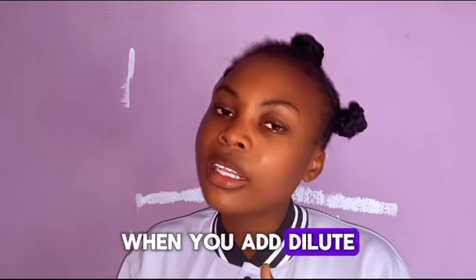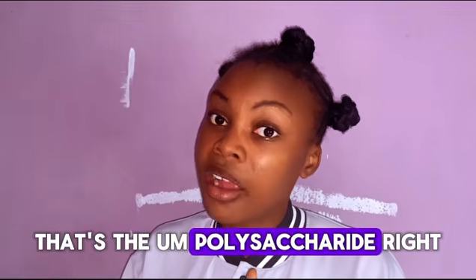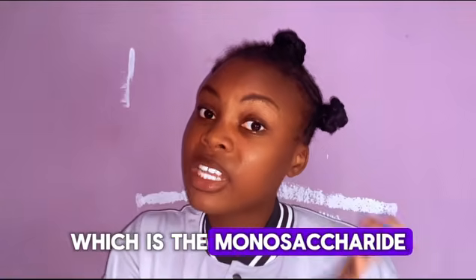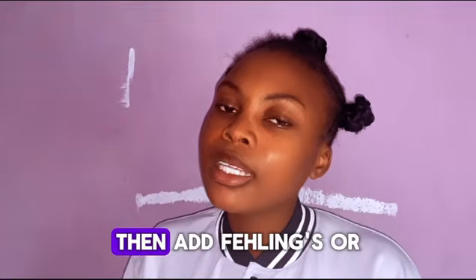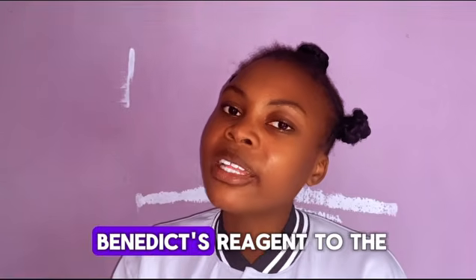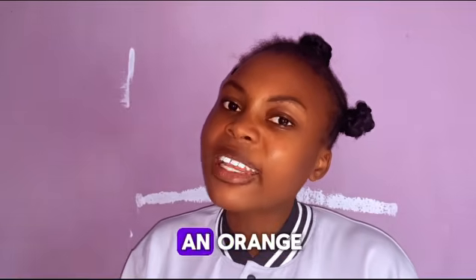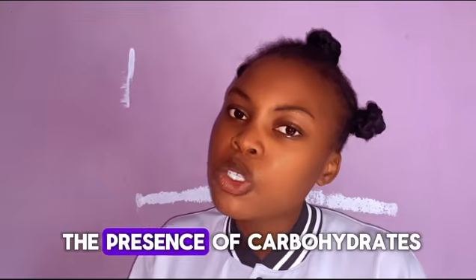When you add dilute HCl to a complex sugar, that's the polysaccharide, it will be hydrolyzed into simple sugar, which is the monosaccharide, like glucose. Then add Fehling's or Benedict's reagent to the simple sugar. The formation of an orange-red color precipitate confirms the presence of carbohydrates.